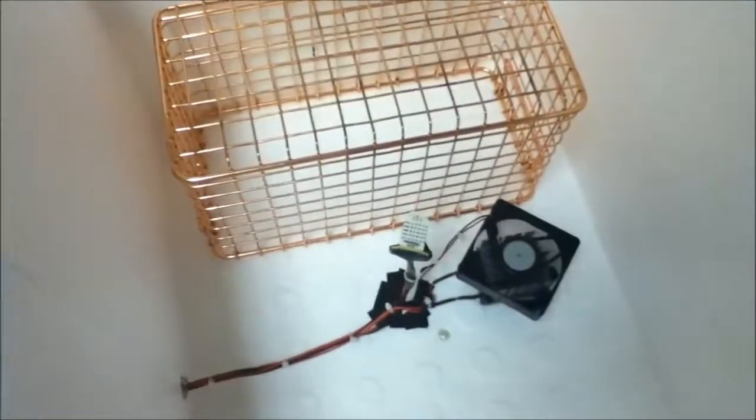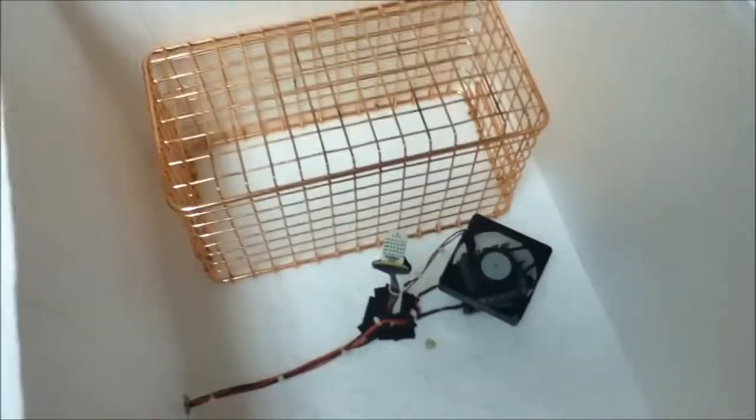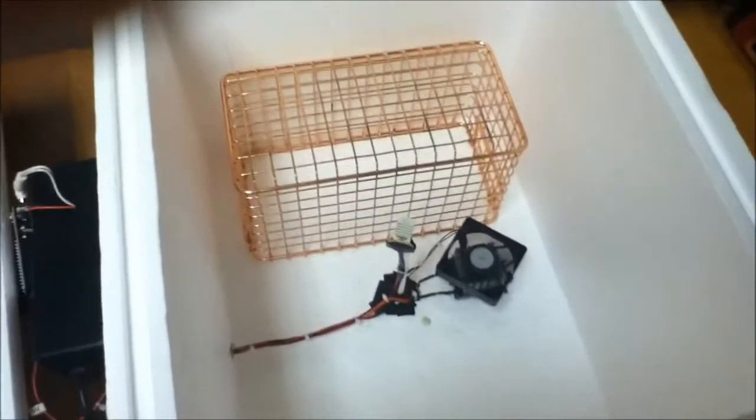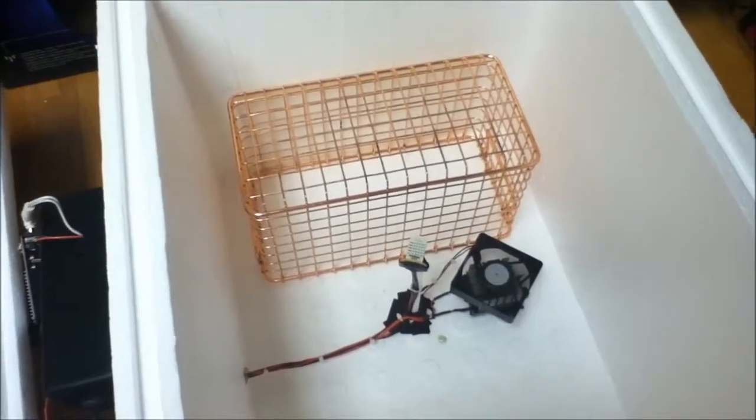The total cost was only about somewhere between $200 and $300. There's a humidity sensor and temperature sensor. For heating, I used an old CPU heatsink with power resistors underneath, with about 27 volts of AC current going through them. There's also a 5-volt fan.